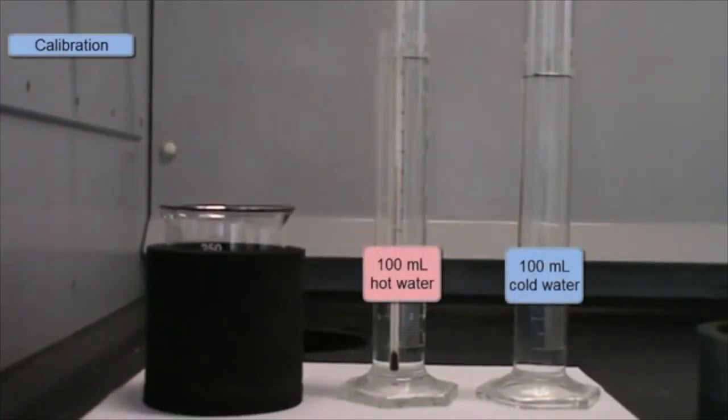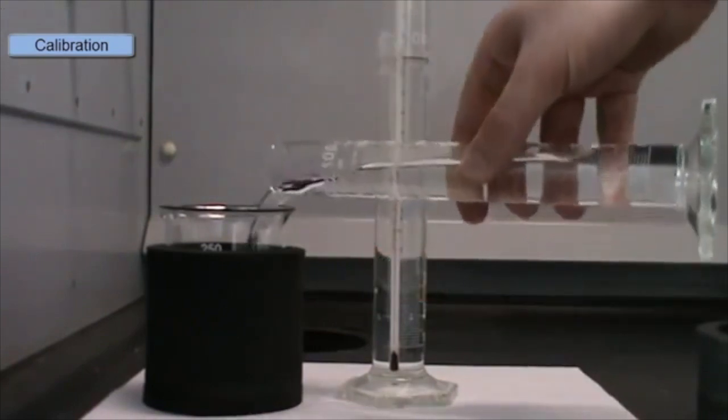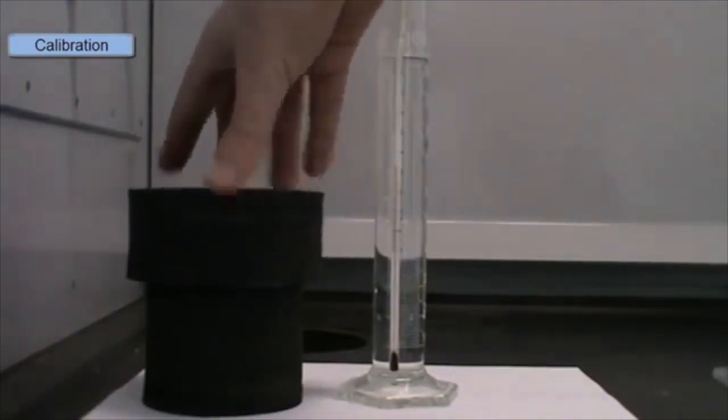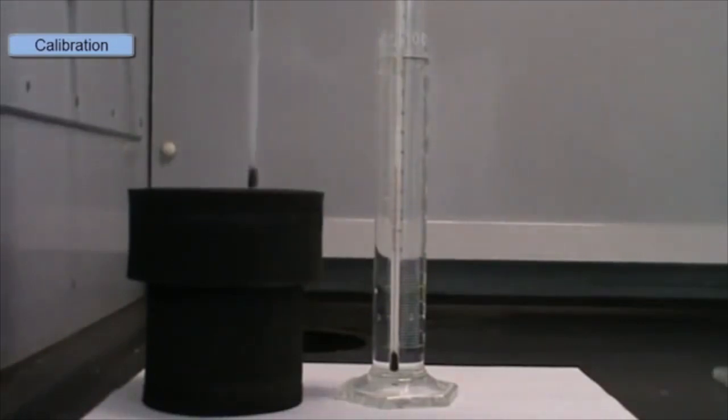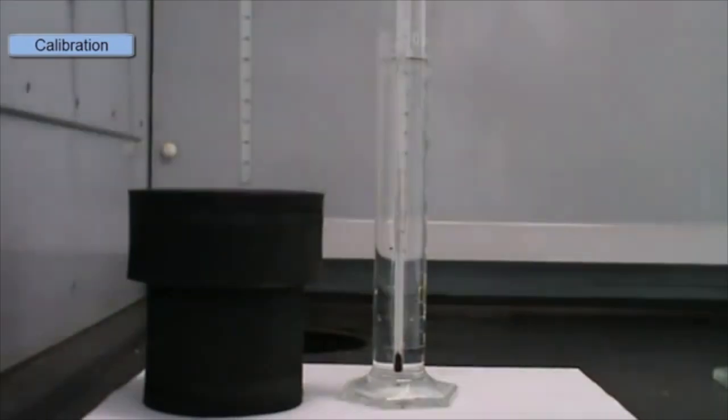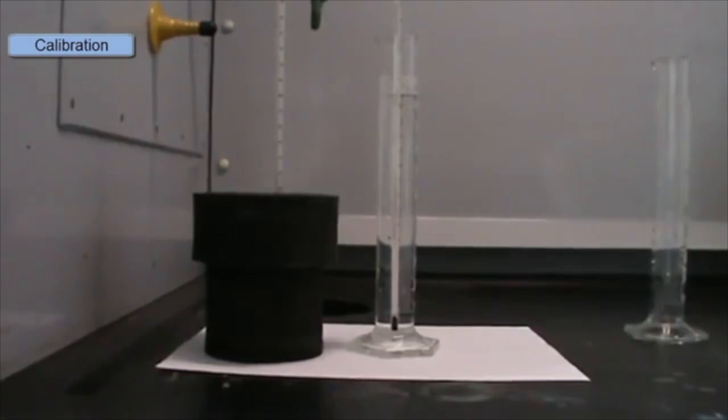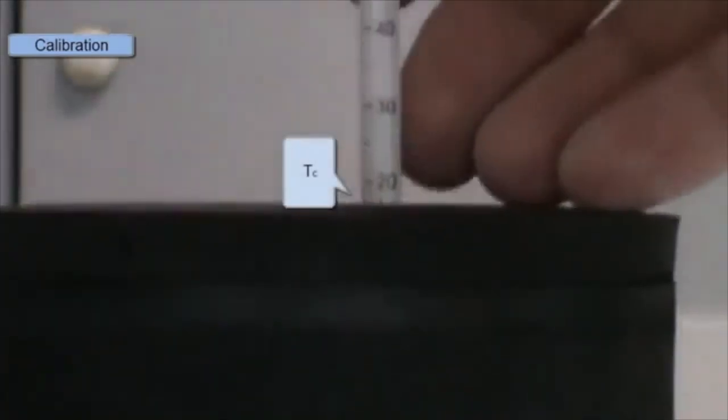So in the calibration step we'll take 100 mils of hot water and 100 mils of cold water. We'll add the cold water into the calorimeter, put on the lid and measure its temperature. So we'll put in there our thermometer and we'll measure the temperature. This is the temperature of the cold water. So our temperature of our warm water here is just under 33 degrees and the temperature of the cold water is just 18 degrees.